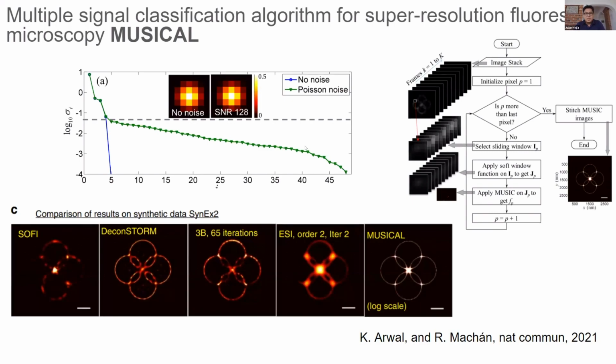So you have matrices over there that you multiply together. The code is quite interesting. It was mathematically challenging. And then you have all this process that I just mentioned happening at once, just applying and multiplying vectors in the software, which I find beautiful. After you have this process done, you will come out with one single result, which is your result working region. And then you stitch it together to reconstruct the final image.